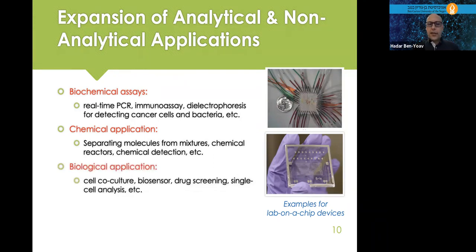And biological applications, such as taking cells and culturing them, into tissue engineering, for example. We saw yesterday the application of making the retina cells, or even single cell analysis. And there is a very nice application for that.